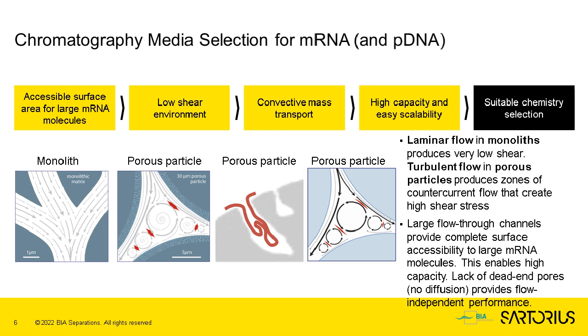to match this large size of mRNA, meaning that chromatography, as has been traditionally employed for purification either of small molecules or proteins, which was based on porous particle based separation, no longer necessarily fits the paradigm of mRNA for multiple reasons.